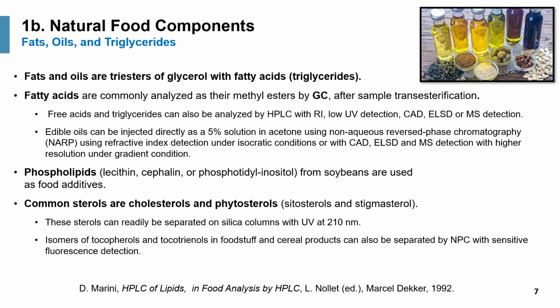Next one is natural food component of fats, oil, and triglyceride. Fats and oils are triesters of glycerol, bonded to different fatty acids, called triglycerides. Fatty acids are commonly analyzed using gas chromatography as their methyl esters after sample transesterification.